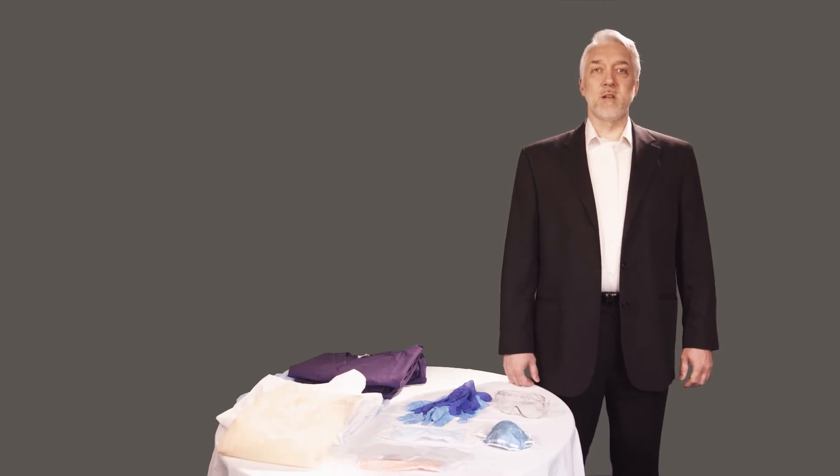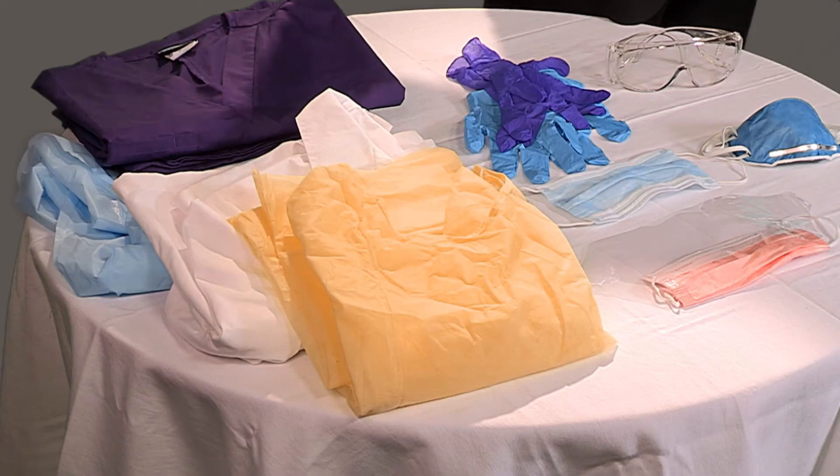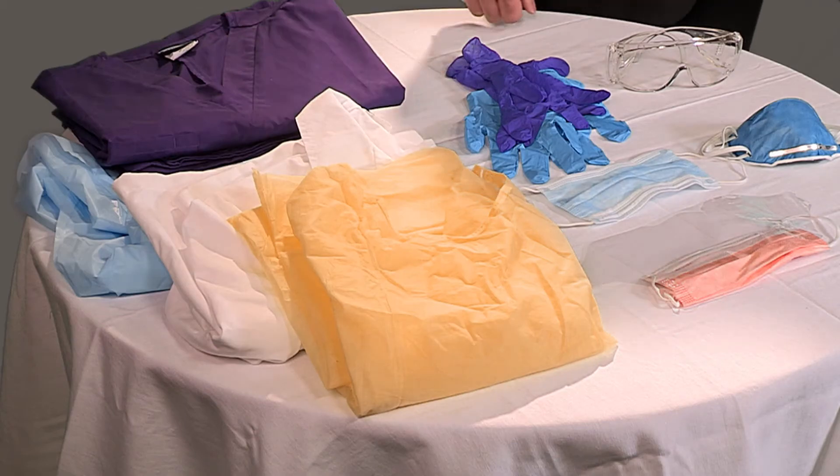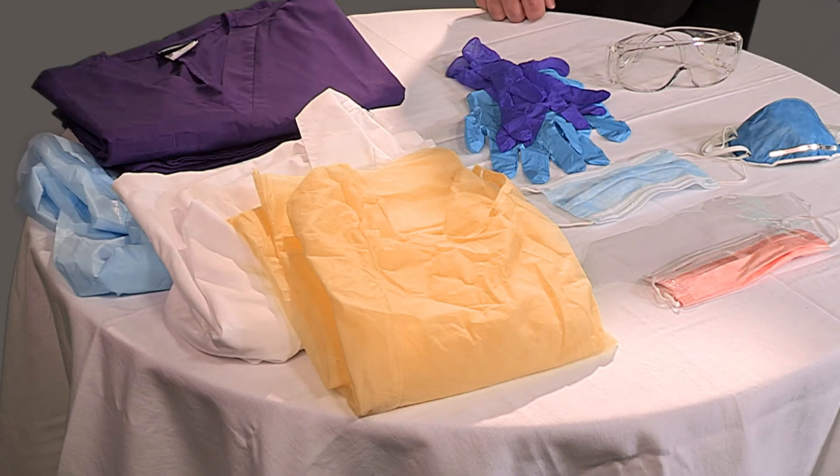PPE protects your skin, eyes, and regular work clothing from exposure. Your hands, face, and eyes are the main focus of skin protection.